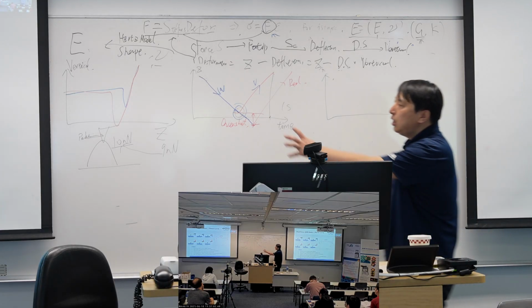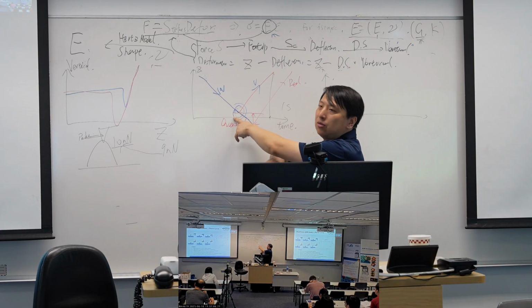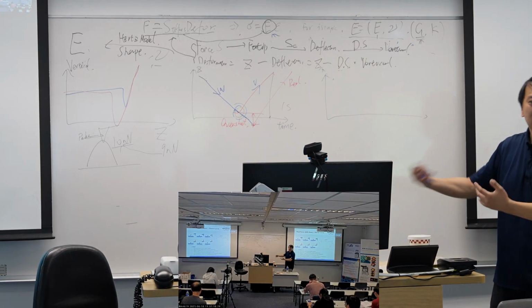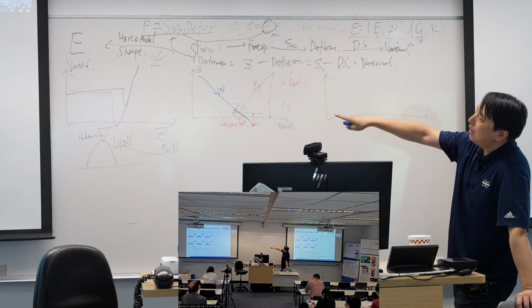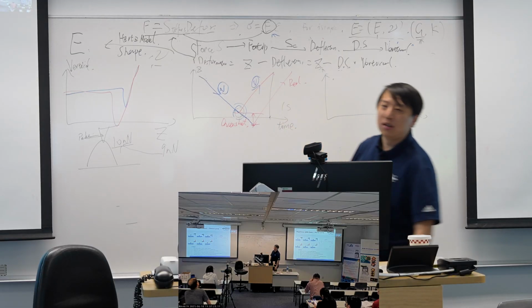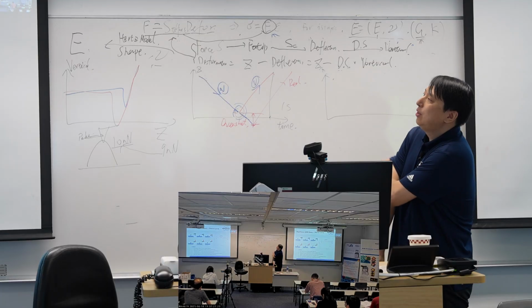If our velocity can be reduced to 0, then we conquer Newton's law. We can just get rid of the overshoot. So the solution here is how we can reduce the velocity to 0 at this point. So we think about it.